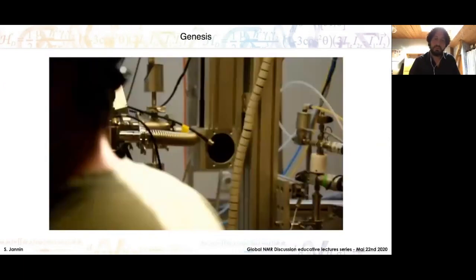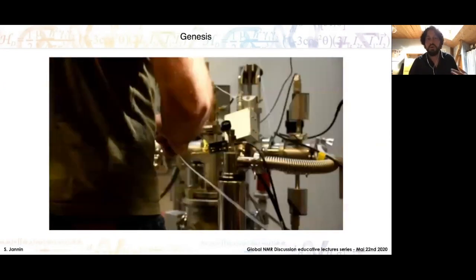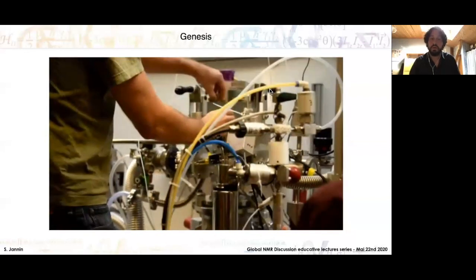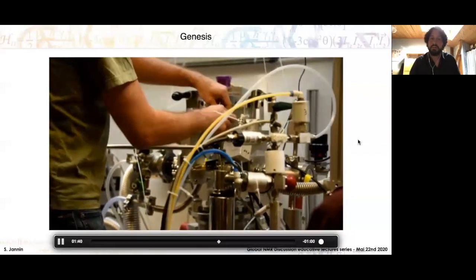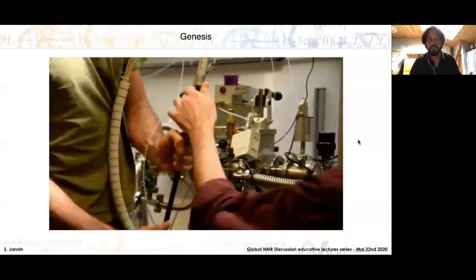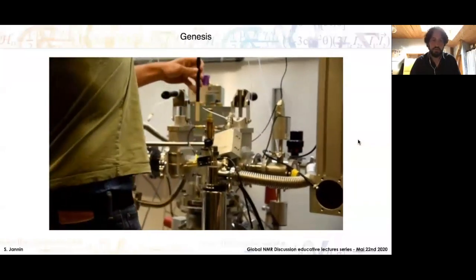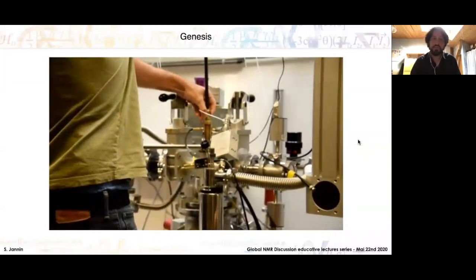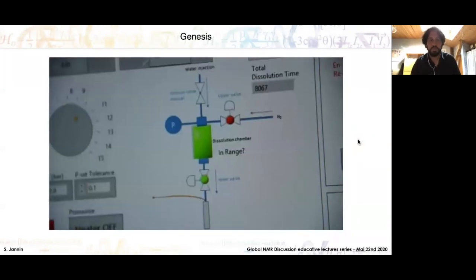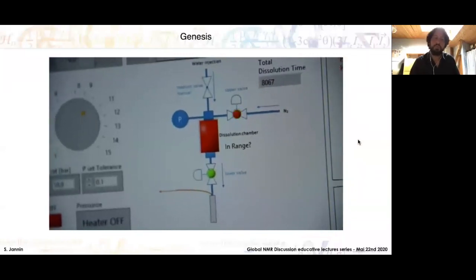And once this is coupled, you can press a button and release the hot water on the sample. Thanks to high pressure helium gas, the sample will be pushed out in the liquid state out of the cryostat and transferred to the NMR spectrometer in a matter of a few seconds. So now the stick is brought down, the button is pressed, and there is a set of valves that open and close to push the sample out.